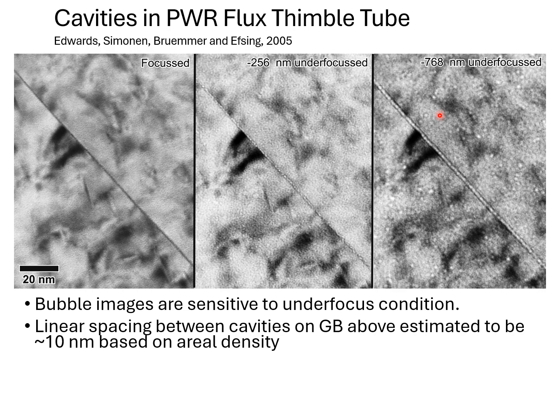If you have a well-aligned microscope, well aligned for high-resolution electron microscopy, and you pay particular attention to the stigmators, if your objective stigmators are nicely aligned, you will see these bubbles. You'll see them with better contrast as you go through focus because of the Fresnel fringing that one observes. But it's not the change in the focus that's important. It's the fact that your microscope is aligned.